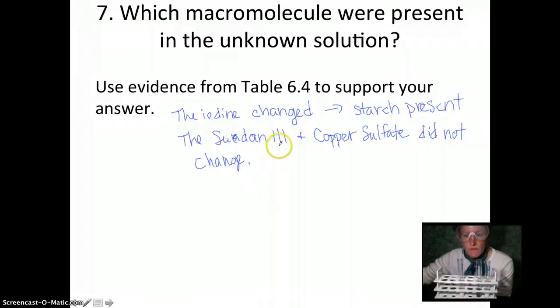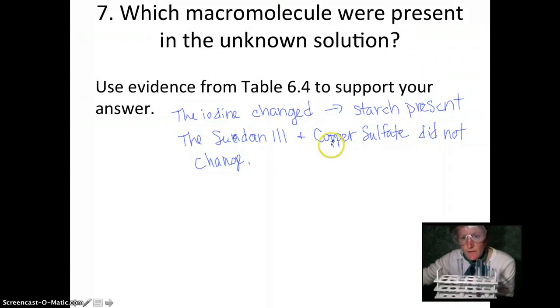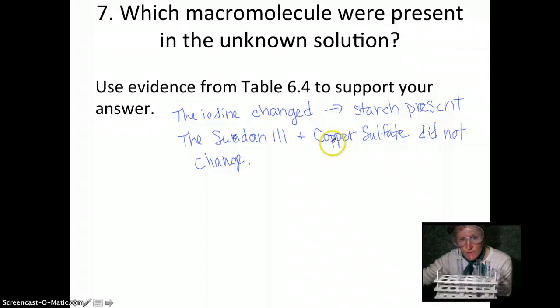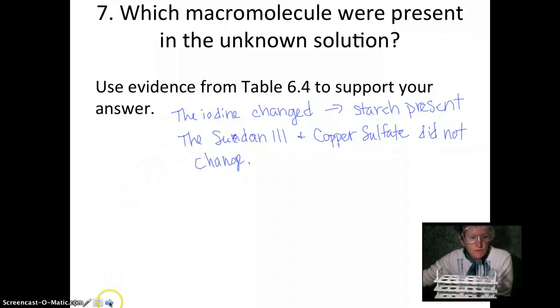When we ask copper sulfate indicator is there protein in the unknown, it said no because it did not change color. Indicators answer yes or no questions in this lab. Sometimes indicators can answer how much of a compound is in a lab, and I'll demonstrate a little bit of that later.